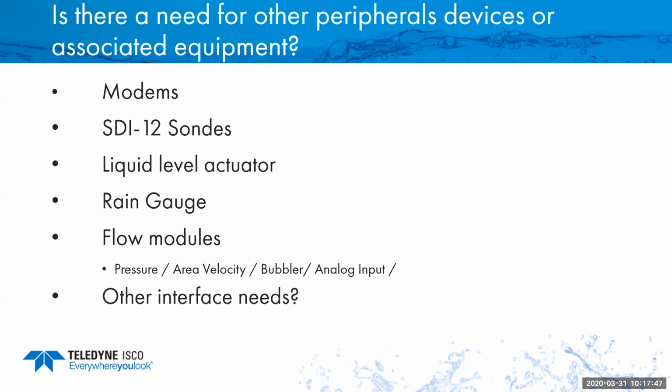There are samplers that will interface with those sondes, and then you can actually sample based on all of those parameters. When my pH goes over 10, I want to start my program. I want to actually start sampling, things like that. A very common thing to do. You can do it off of pretty much any parameter it reads: temperature, conductivity, turbidity, whatever the sensor reads, you can usually trigger the sampler based on those parameters.